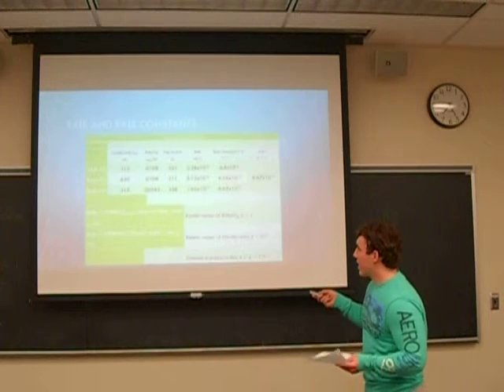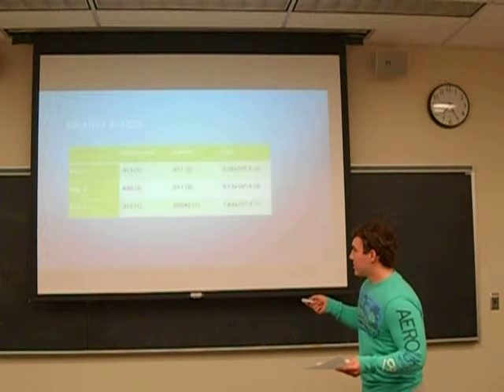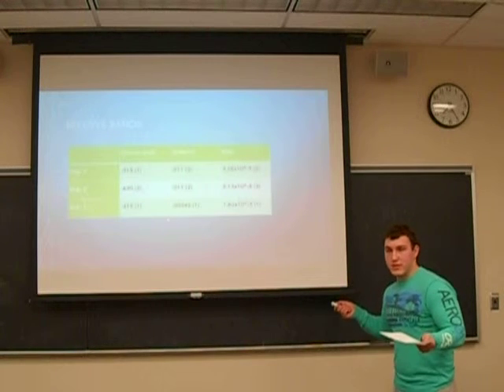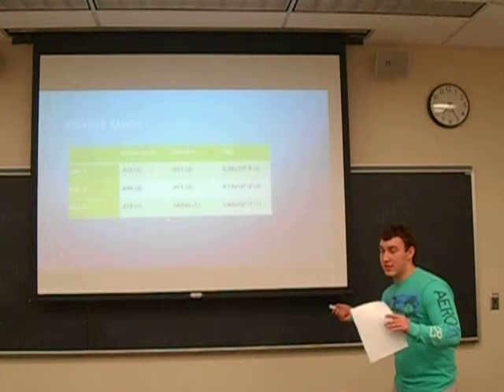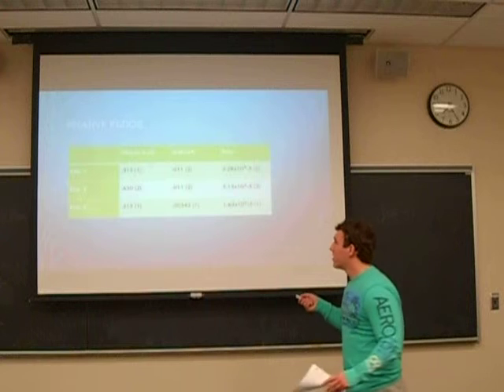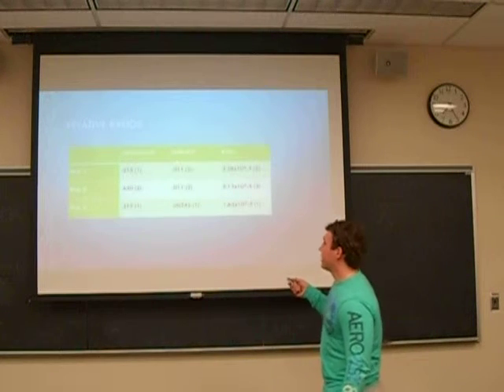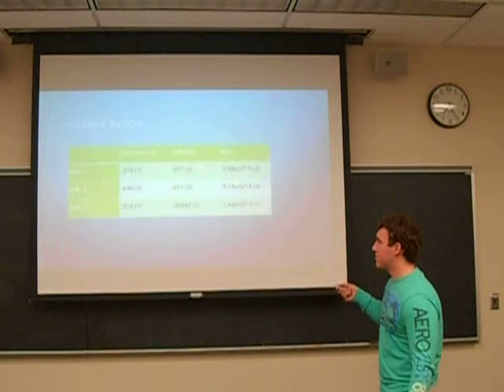I kind of have to skip forward to make sense of this. Your different results ended up coming out in a bit of a ratio thing, and this is somewhat different. I showed Dr. Jean this, it's how I learned it in high school. It's different from Devon's. You didn't solve for X and R. You look strictly for ratios, and if you look, one is held constant here, the KMnO4 is held constant, it's both at 2.